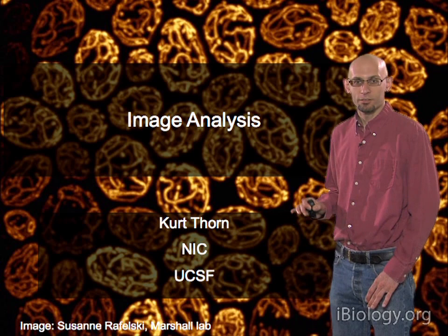We're applying this 3x3 kernel here, and so if we want to filter something in this top edge here, we need to figure out what the numbers up here, one row above that edge, should be. And obviously, there aren't any numbers there. And so there's a number of different approaches that people commonly use to deal with this. The simplest is probably just to assume that any numbers outside of your original image are 0.